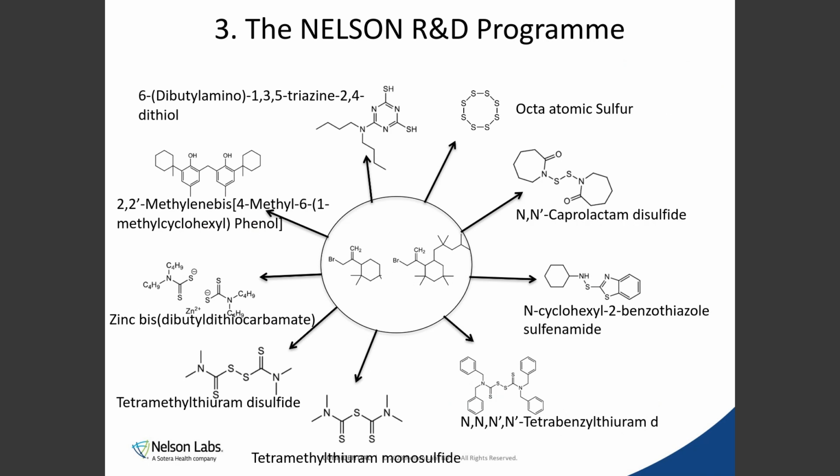Well, if you look at the expected compounds, you can see in the center of that circle the compounds we tried to react anyway. That is the rubber oligomer, and we reacted that with a number of proposed ingredients of a rubber production mixture. And we simply reacted per type of reaction. We tried simply to compare if something would happen.